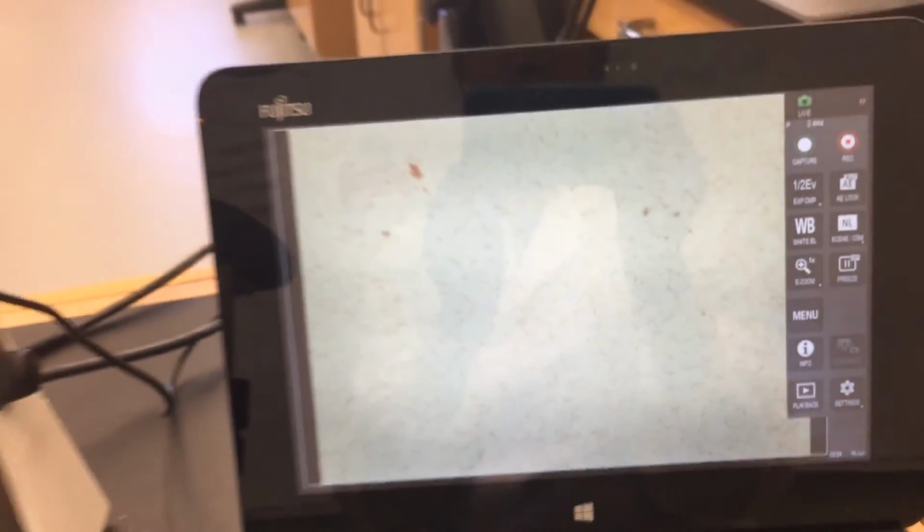This is sample B, and you can see this field. 1 field, 2 fields. Okay, can you see those? This would be 3 fields. Gone out of focus. Get to it. Okay. Oh no. I don't know when it stopped filming, but there you go. There's a field.